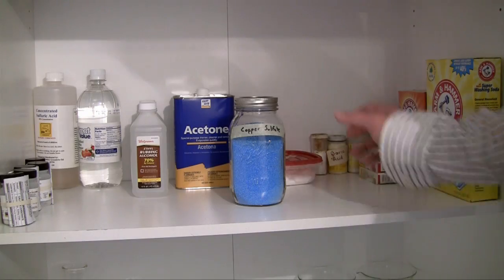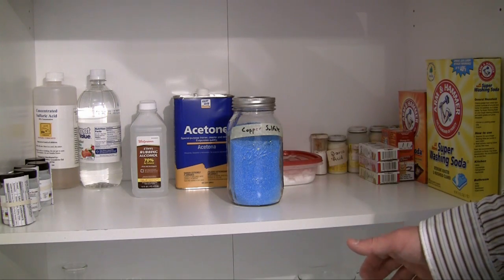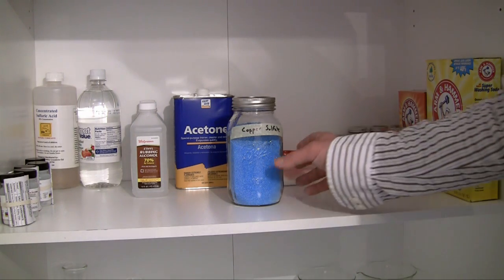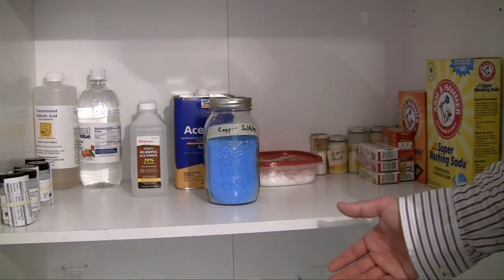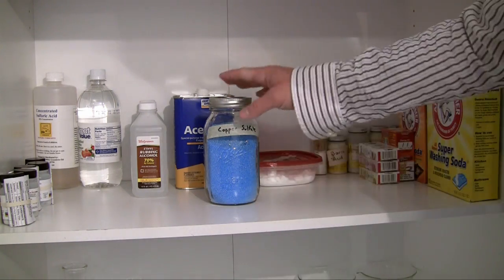Now here are some of my legal chemicals and a couple tips I have for storing chemicals. First of all make sure to store them in proper containers. Whenever you buy chemicals online they typically don't come in the best containers.